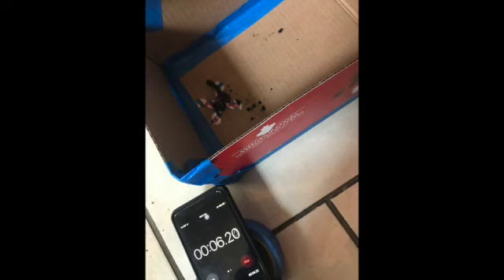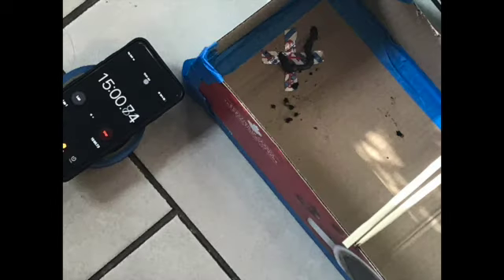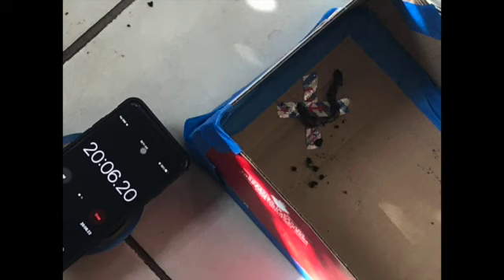For the second trial, there was no light shown on the worm. Throughout all of the testing periods, I noticed that the worm did not move away from the X. A total of 0 centimeters were traveled away from the starting position. This was the worm at 5 minutes. This was the worm at 10 minutes. This was the worm at 15 minutes. And lastly, this was the worm at 20 minutes.